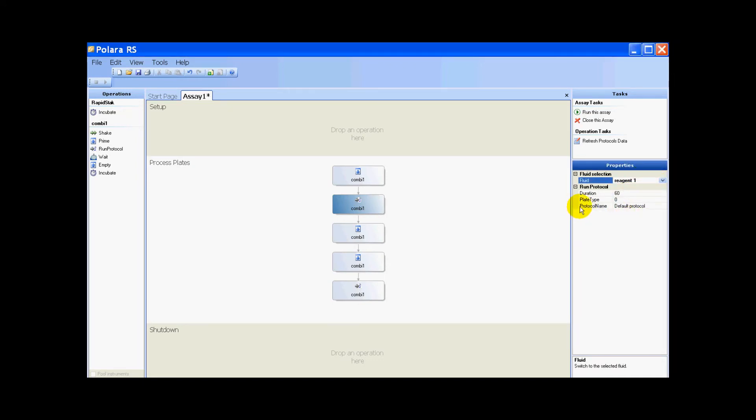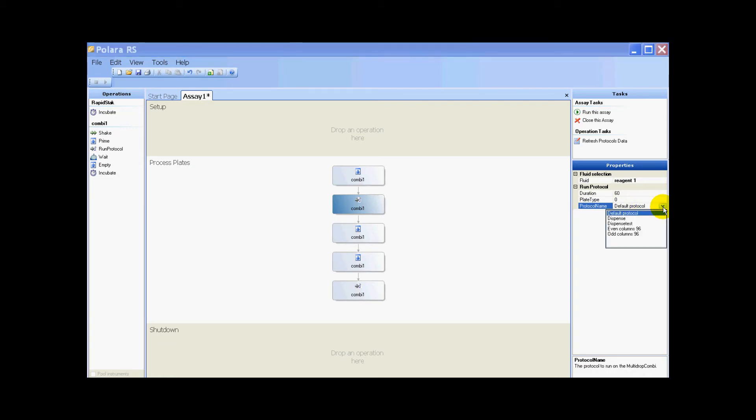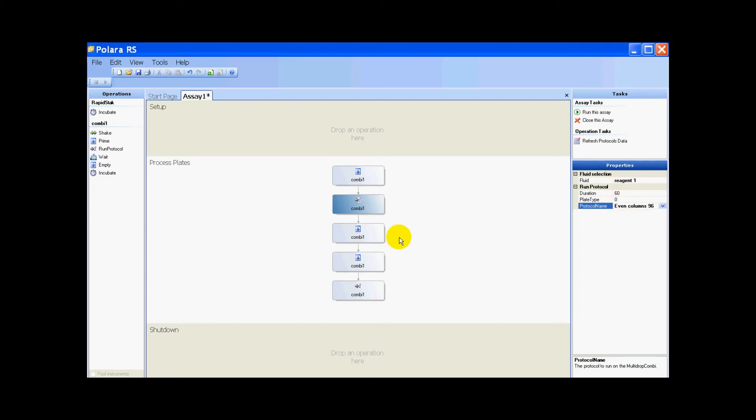For the protocol name, I'm going to pull the protocol from the combi. For the first run, it'll be even columns, 96 wells.